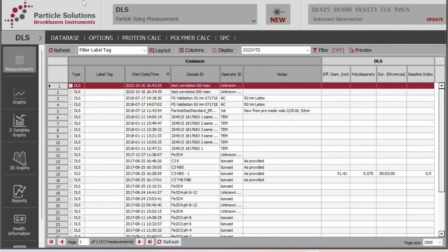Welcome to the Brookhaven Instruments Particle Solutions software training video. In this video, we will introduce you to the application and provide a tutorial for creating an SOP.